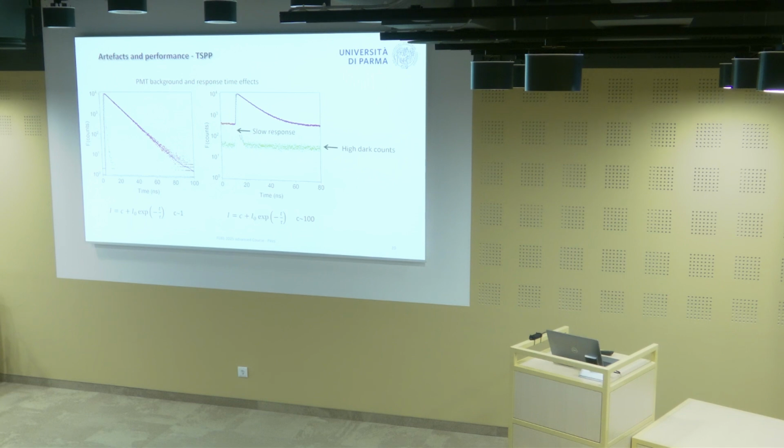signal. Except that here you have a very high background. You see, even for the IRF, you have a background which is in the order of a few tens, whereas here you have 1 or 2. So it's orders of magnitude worse. In addition, fluorescence emission is weak, and so you have to count photons for longer times.